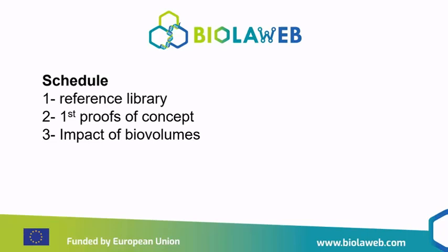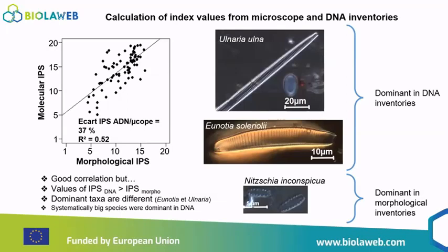So maybe I can stop here, or if you want, if that was the plan. No, because I have it just here, but it doesn't matter. Do you have questions about this first part? No? As you want. But just to introduce that we had this hypothesis that there was an overexpression of the large species in our sequencing data compared to what we have in microscopy. Questions about that? As a result, we can continue if you want.